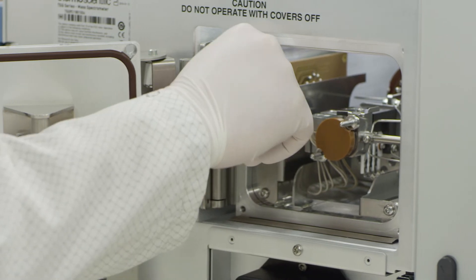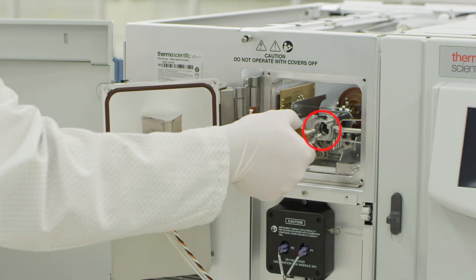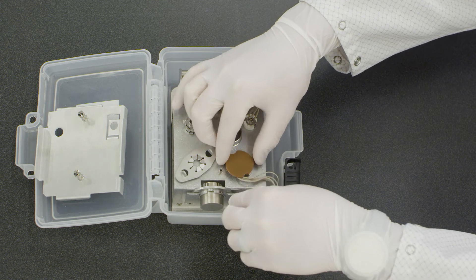Remove the filament connection to the source interface board. Carefully remove the AEI source by pulling the source straight out. Place the AEI source in the designated location in the source box.